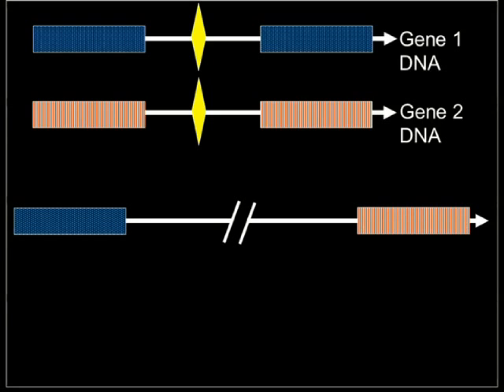This didn't tell us what mutation was there. It just told us there was something different. And you can imagine what polymorphisms did for this, of course, because a polymorphism would show up exactly like a mutation. So there's no way to tell what the mutant is in this technology. If you got a positive when you did this, you would then go and sequence the ones that looked positive, and you would find out if the mutant was there or not.